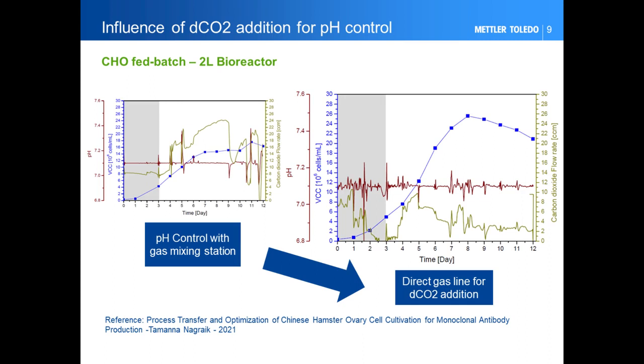Since the cells follow the expected growth pattern, the feeding continued as planned due to the demand of nutrients by the cells. The amount of CO2 sparged into the bioreactor and feed medium supply has a direct influence on the cell growth. Interesting finding that suggests to look at how CO2 as a gas, when sparged into media and dissolving continuously into media, is affecting the process. It's also confirming at bench scale to better look at CO2 management and how, for scale-up, it will impact pH control.